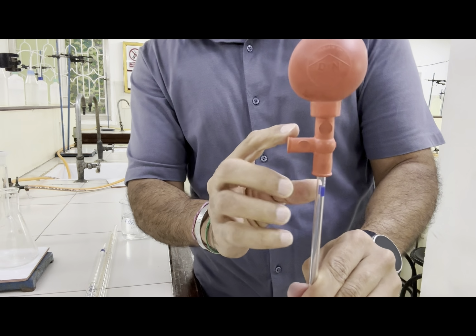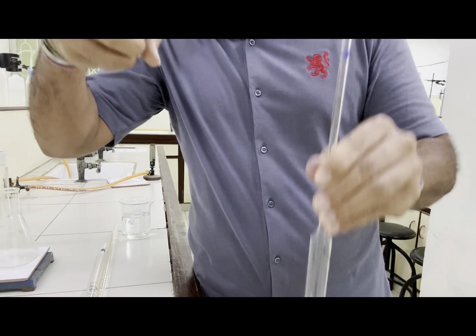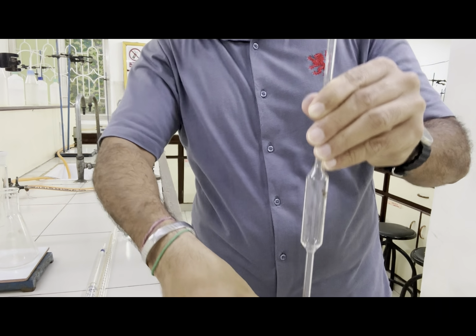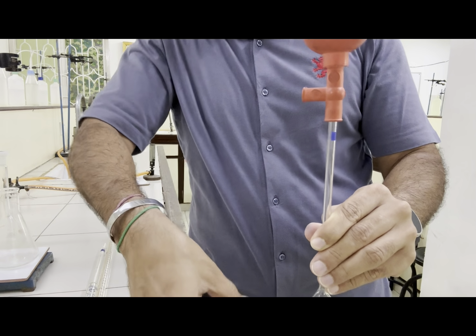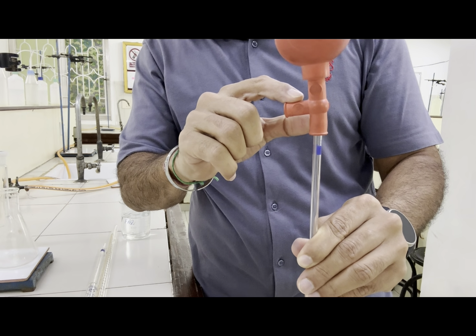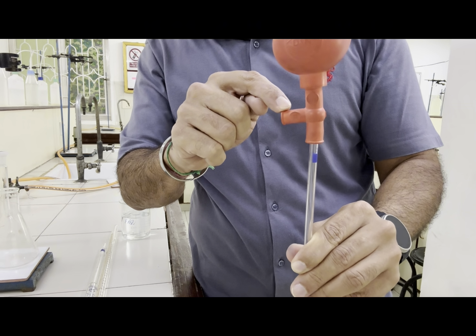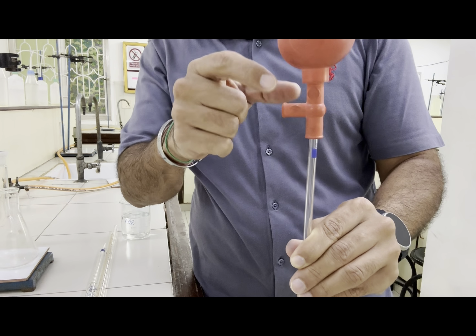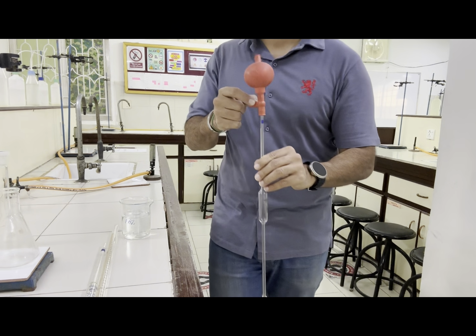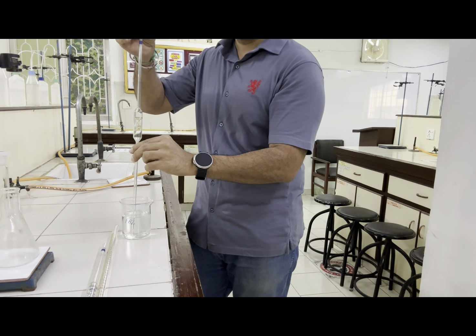Then it has the S button here. S button means suction. So when you put this in any solution and press this S button, it will start sucking up the solution. This E button stands for ejection of the liquid. When you have filled anything and you want to eject that liquid out, press this E button. So now let's press this S button and fill the liquid up till the mark.